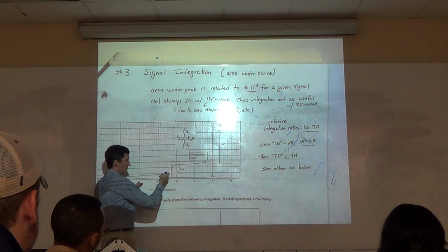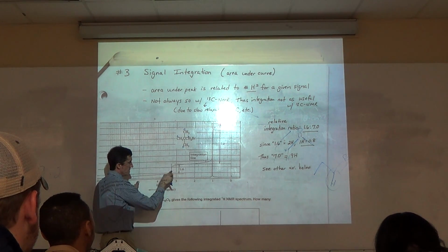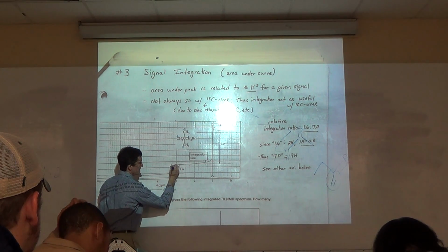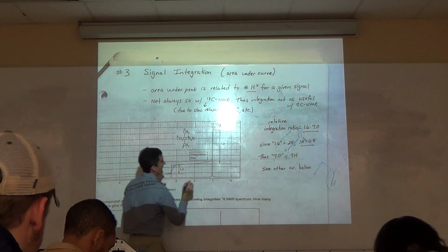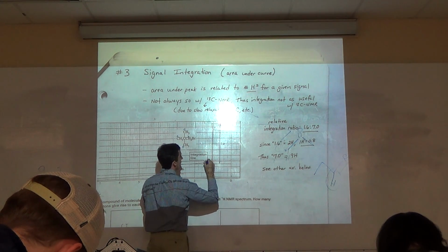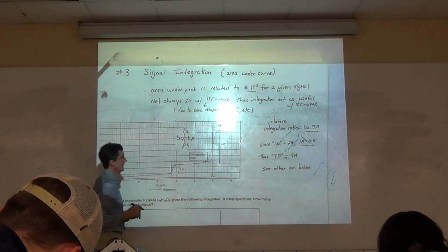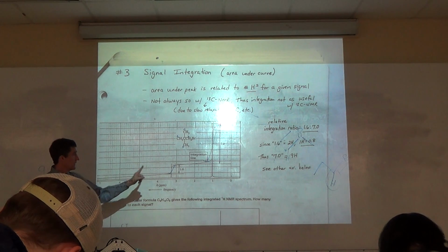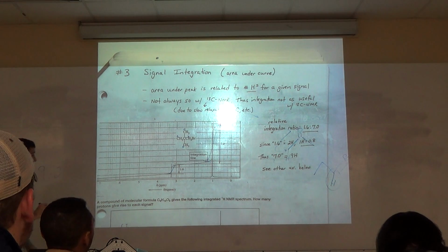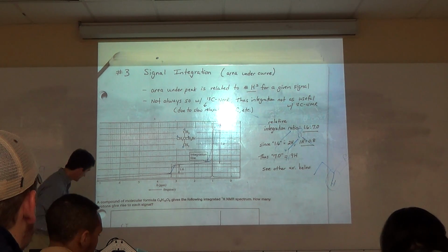This is an integral curve or line. This is something that you get from the instrument, and you use it by measuring from where it starts rising to where it ends. And you measure this length, integrating over the curve, the area under the curve here. And that length should correlate with 9 to 2. Now, if you didn't know it was 9 to 2, and you didn't know the structure, how would you figure out it was 9 to 2? So you can measure it.